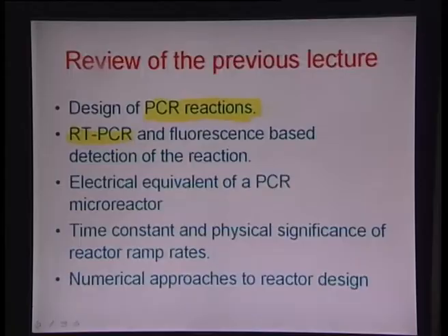We also talked about real time PCR, which is essentially a snapshot by snapshot view of how the amplification reaction proceeds.